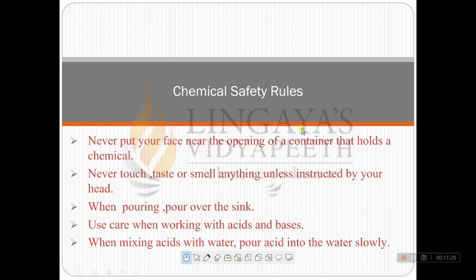Now, what are the chemical safety rules that you have to carry out every time while working in the laboratory? First of all, never put your face near the opening of a container which holds a chemical.